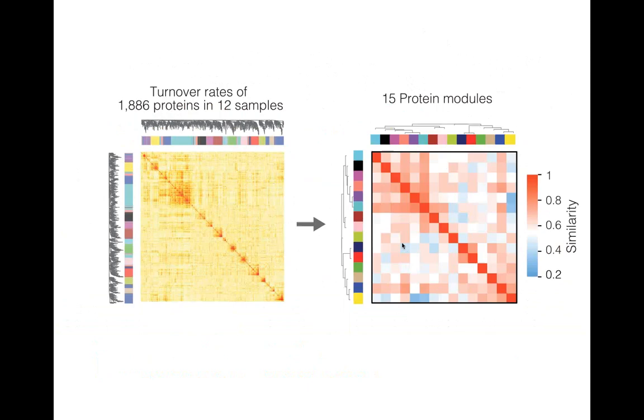But basically, what it does is it compresses. We have around 2,000 comparisons among the 6 strains. The package compressed this data into maybe 15 modules, or clusters of similar behaviors. So we can now just take these individual clusters to do correlation comparison with the traits, and it sort of relieves the burden of multiple testing. Instead of doing 2,000 hypothesis tests, now we're doing 15 of them, using clusters rather than individual proteins.